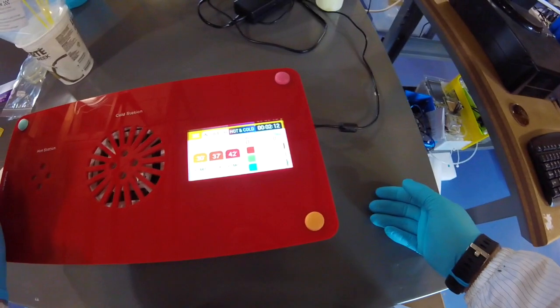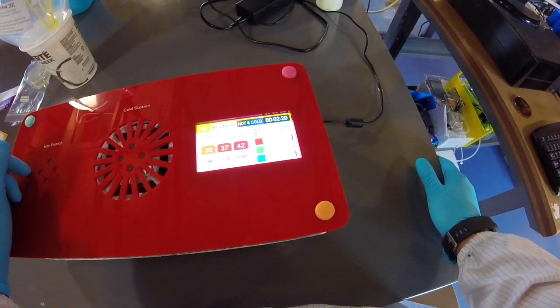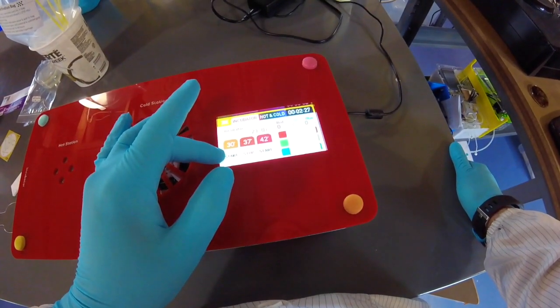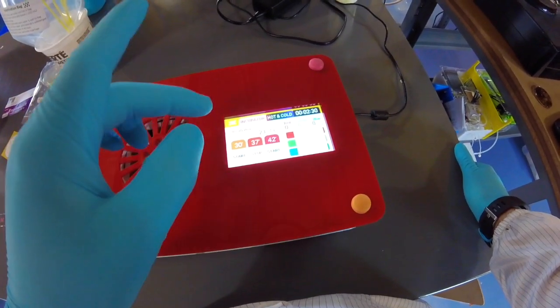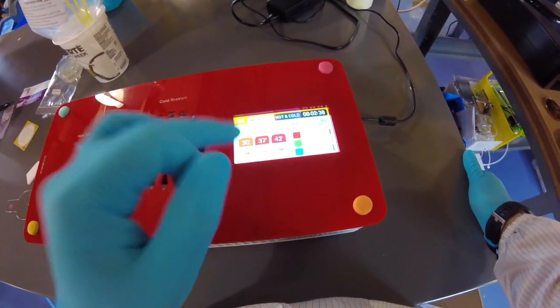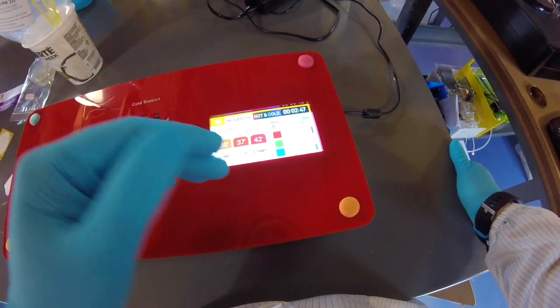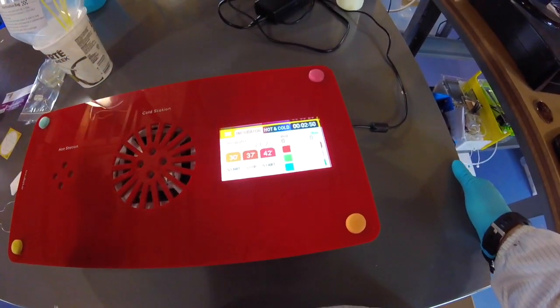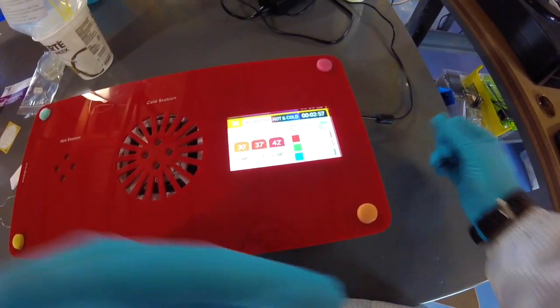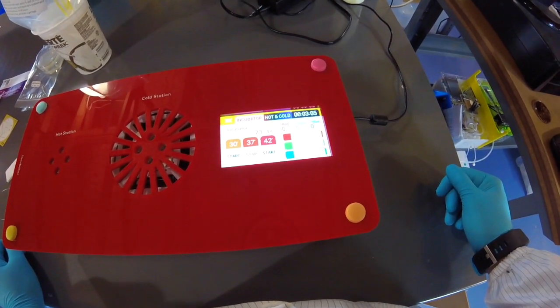Some tricks that some teachers will use if you're on a very strict schedule for classes, for example, is if you start with first setting your cells at 30, so let's say you have a class in the morning, and then you've got another class like right at 24 hours later, or even a little more. You can grow your cells initially at 30 for like the rest of the day, and then right before home from work, you can turn it up to 37. And that way, they'll grow a little slower at the beginning, and then when you up it to 37, they'll grow at their normal pace again. But you've kind of like shortened how much they're growing by lowering the temperature initially. Okay. Alrighty, so we'll leave it at that for now.